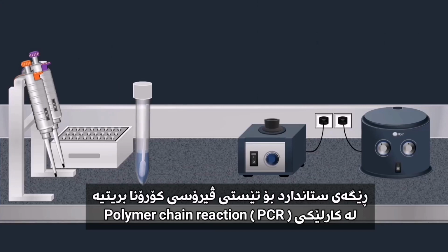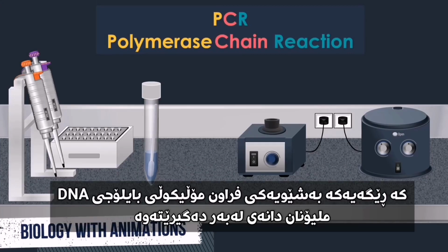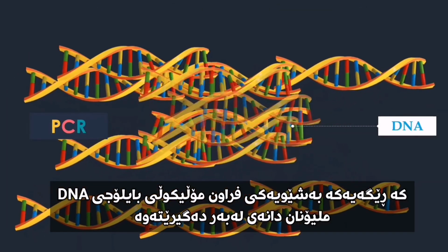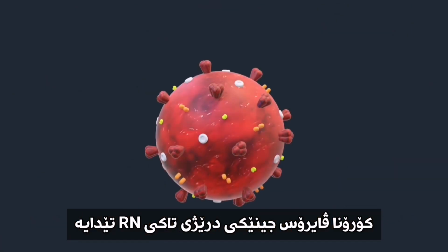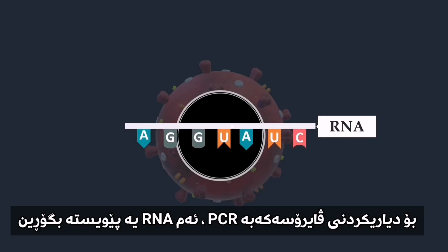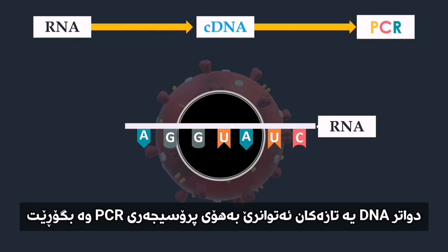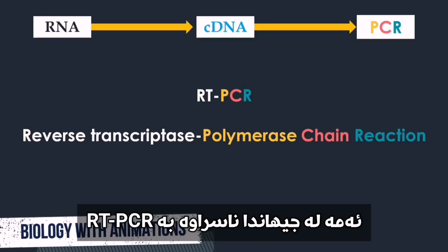The standard method of coronavirus testing is polymerase chain reaction, PCR, which is a method widely used in molecular biology to make millions to billions of copies of a specific DNA fragment rapidly. Coronaviruses contain an extraordinarily long single-stranded RNA genome. To detect these viruses with PCR, RNA molecules must be converted into their complementary DNA sequences by reverse transcriptase. Then the newly synthesized DNA can be amplified by standard PCR procedures. This approach is universally known as RT-PCR.